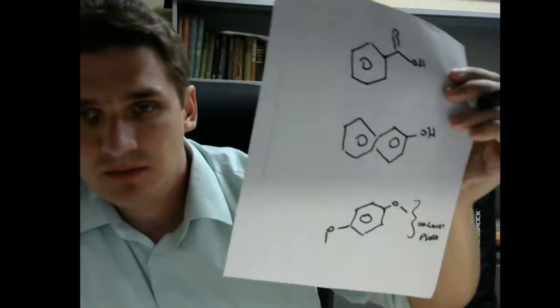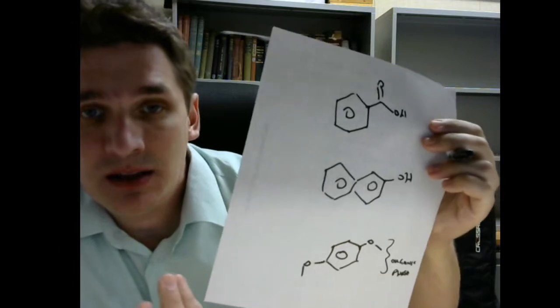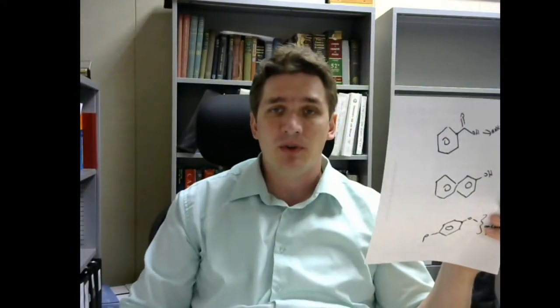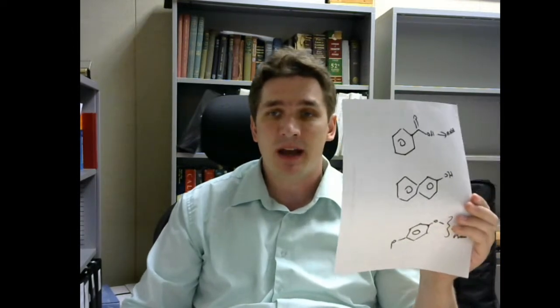So we know the para-dimethoxybenzene ended up in whatever ended up being the organic phase when we were done. Benzoic acid, as the name implies, is an acid. So this is going to react with whatever base you had. The pKa of benzoic acid is less than 7, which means it's a better acid than water. So whatever aqueous phase you added that had a strong base in it, that's going to contain the benzoic acid.